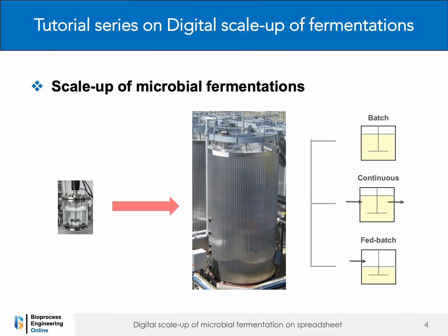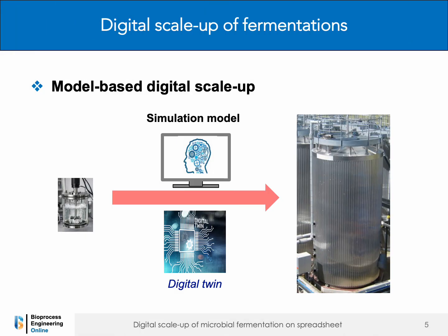In this new tutorial series on the digital scale-up of microbial fermentations, we focus on scaling up microbial processes from the laboratory scale to industrial fermenters, considering batch, continuous, and fed batch modes of operation. The series emphasizes digital scale-up using mechanistic, knowledge-based models to predict process behavior across different scales.